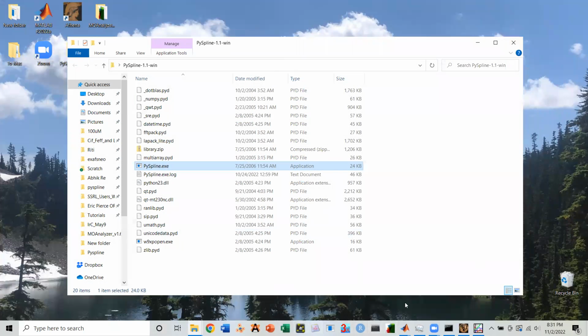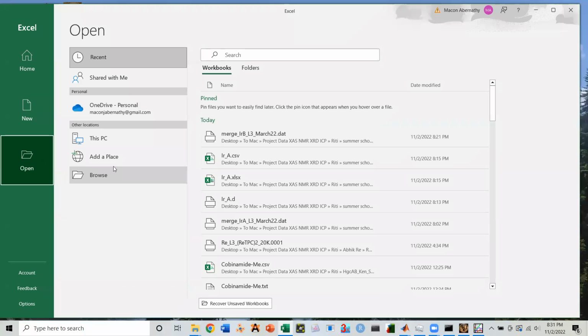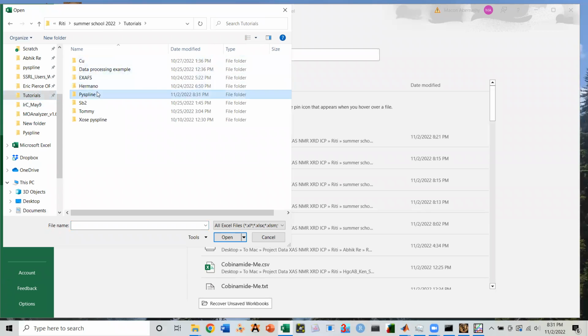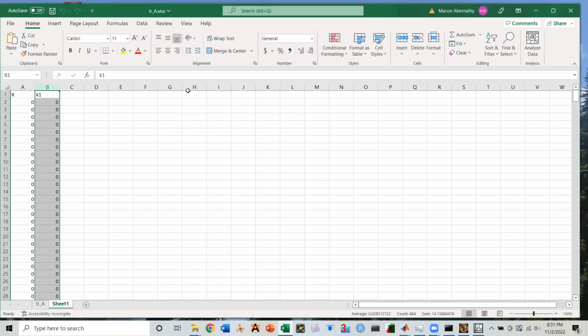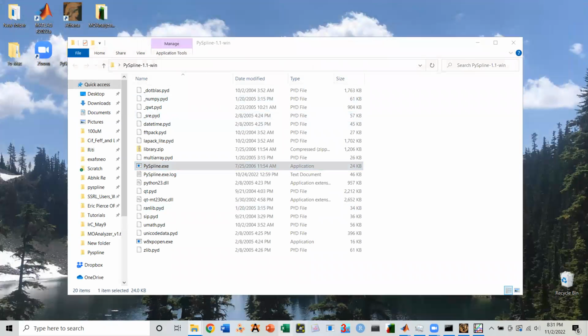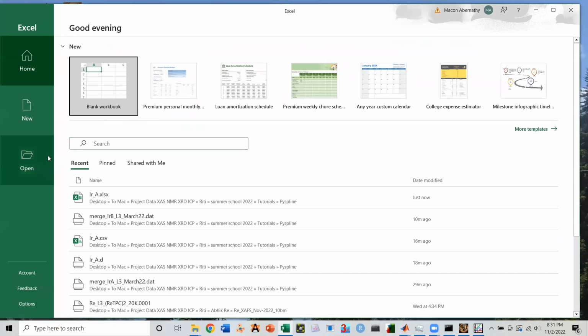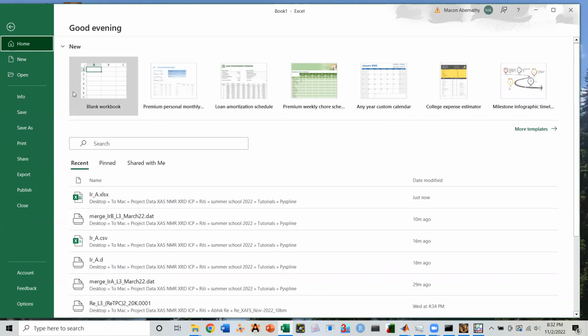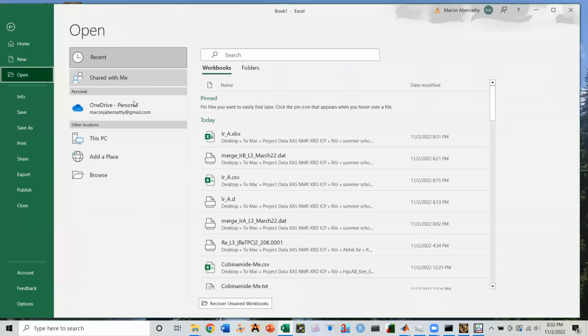So next, we need to do one thing before we can bring this into Athena to compare it to our other data set. And that is, we have to adjust it from a K3 weighting to a K1 weighting. When you import data into Athena, Athena will try to cube whatever chi of k data you bring in, at least as far as I understand it. So we need to make the data from Pi Spline back to K1 weighting.